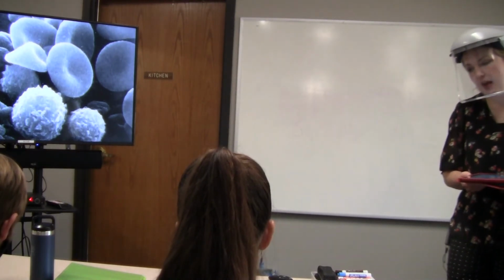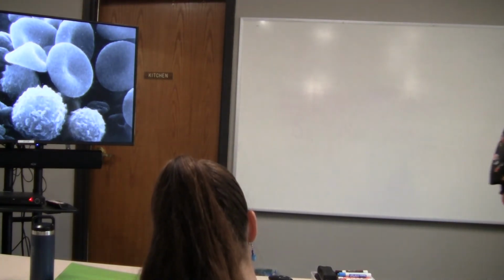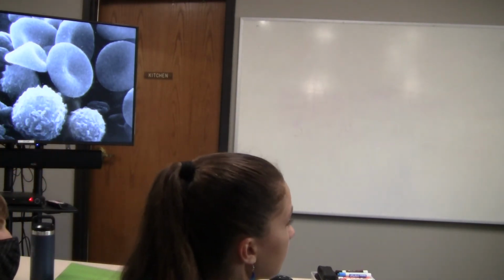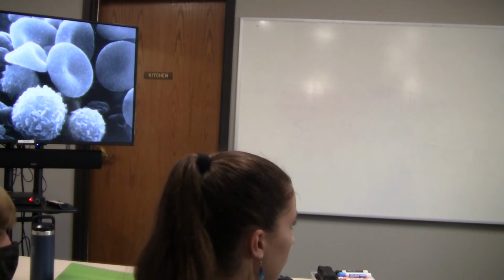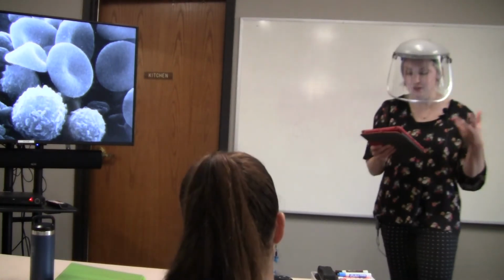Combination of lenses at the viewing end of the optical instrument. That is the eyepiece. So there is a lens here. This technically does come off, and can either lower the magnification or increase it. Some of them have lines on them, so don't be freaked out by that. There's like a needle, so that if I wanted to come around and get it centered on something to show you. So don't be like, there's this line, what is that? It's meant to be there.